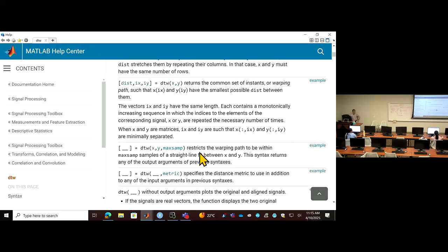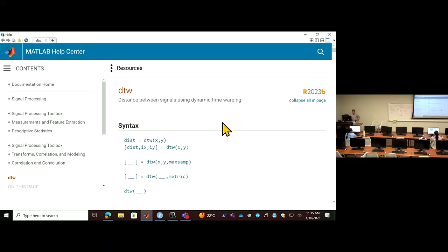So all you need to know is that these functions exist. When you have a problem to solve in real applications, you may realize, okay, there's a function I can borrow. I don't know when. Maybe in pseudo-time trajectory analysis when you have two sets of samples.